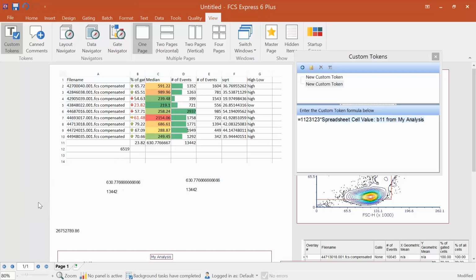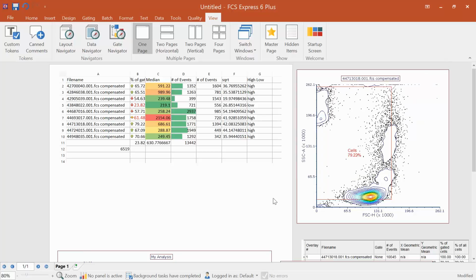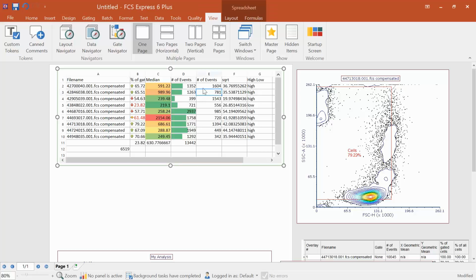So that way we can actually get our report back here into a way that I want to look at for the next and final section of this webinar, which is exporting to Excel. We showed batch exporting to Excel. We showed that as part of the batch process. And batch process can be defined in a number of different ways. But really, if you wanted to take this spreadsheet as it exists now and bring that out to Excel for one reason or another, there's a very quick and easy way to do that.